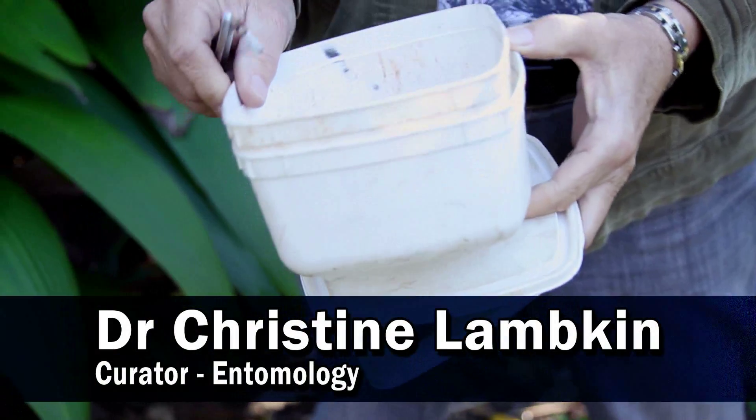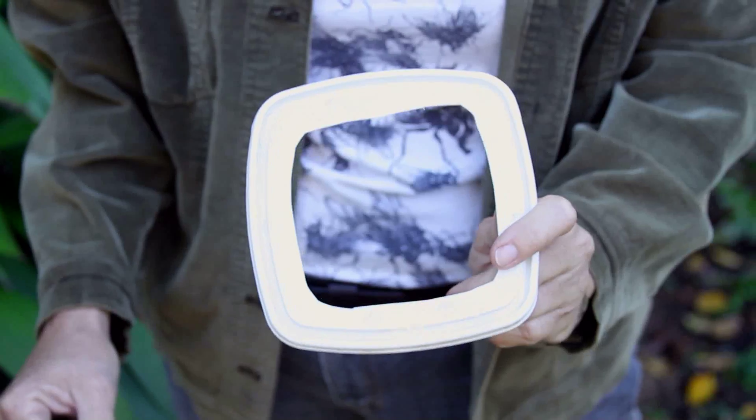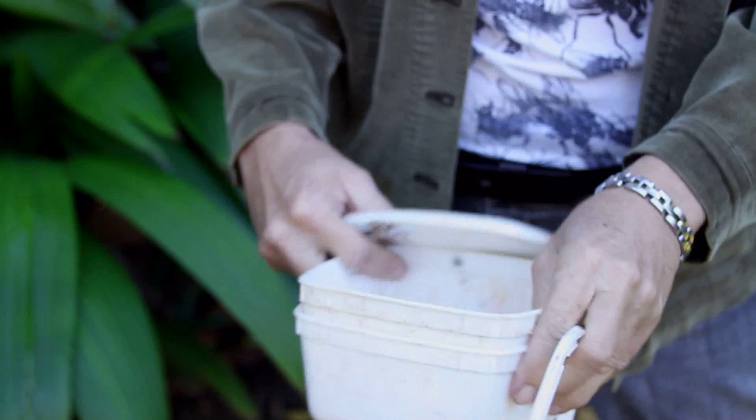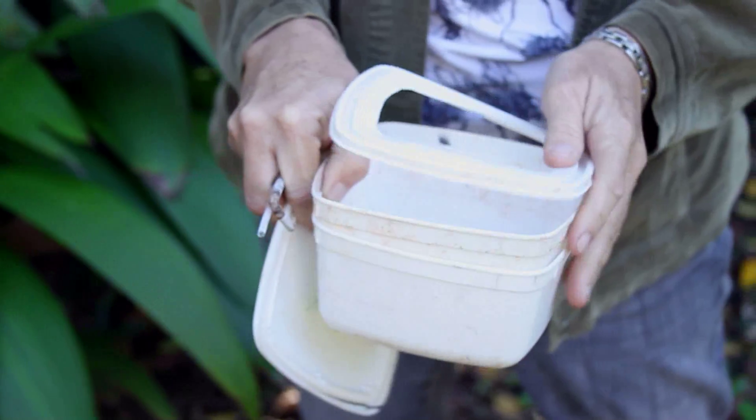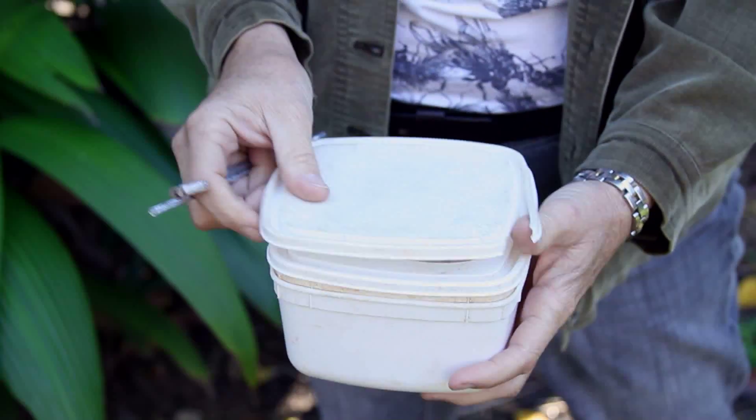To set up a pitfall trap you need two containers the same size with lids. One of the container lids is cut out one centimeter in from the little groove, and that is then placed over the two containers fitted together. Over the top of that goes the complete lid.